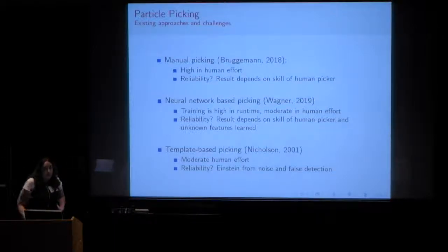And this is actually still being used today, and just last year, a paper came out on crowdsourcing for particle picking. So that's actually manual picking, just not done by us, done by people that we pay.